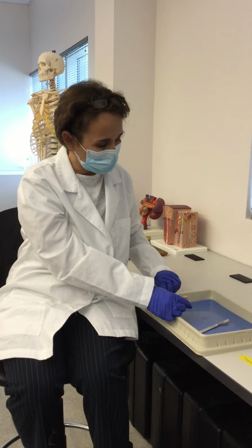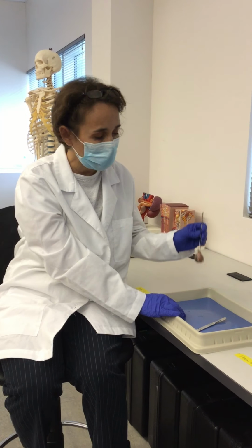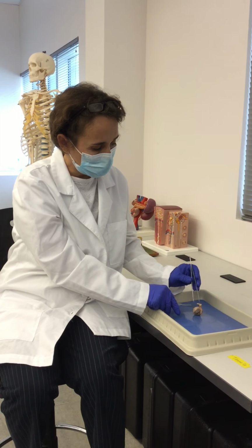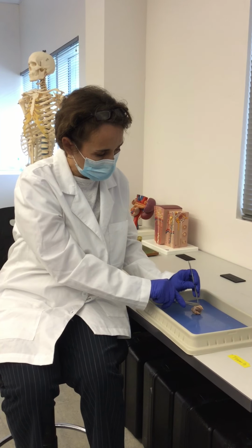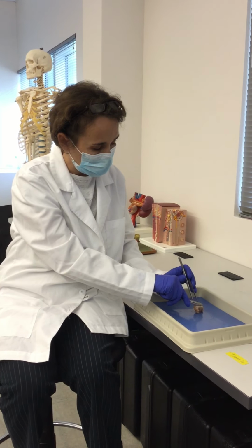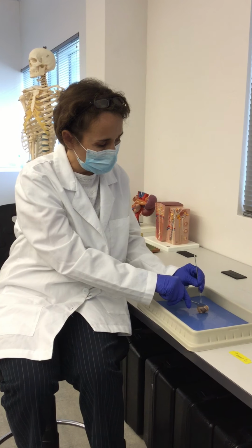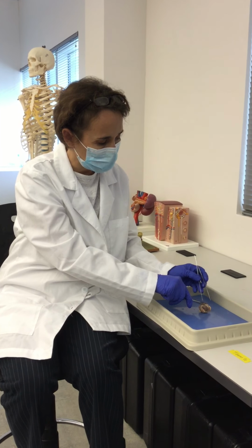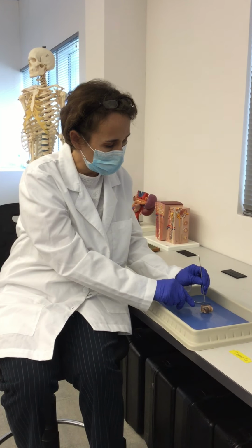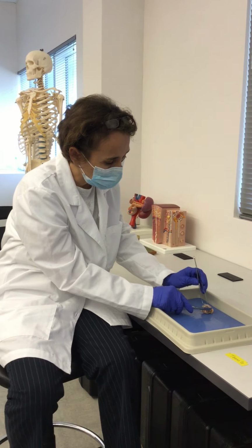So I'm going to hold the outer tissue of the eye, which is basically fat. Our eyes are regularly covered externally by fat, since it's an important organ. So I'm going to hold it with the tweezers, and then I'm going to do this section with the scalpel. It's kind of slippery, and you just have to be careful, because if you try to hold it with your fingers as you're cutting with the scalpel, you might have an accident and cut yourself.